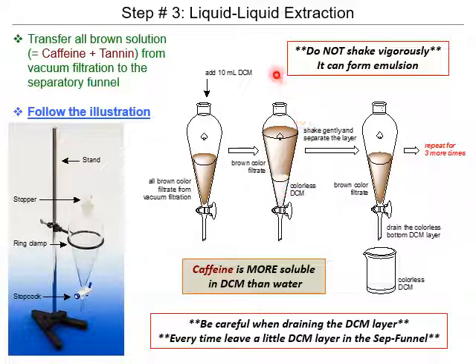One way to do it is to cover this separatory funnel, and then shake gently. The traditional motion is a back and forth, like rocking, with this end pointed away from you and from others, because generally pressure builds up, and you want to open it a little bit as this is pointing up and away from you, so that the accumulated pressure leaves the separatory funnel.